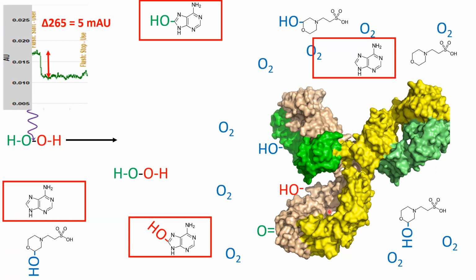And in hydroxyl radical protein footprinting, oxidations equal information. The more oxidation you can get within the appropriate time scale, the more information you have on the structure of your protein. So if you have to increase the scavenging capacity of your buffer, you're reducing the amount of information. Is there a way that I can preserve the amount of information that I'm generating?